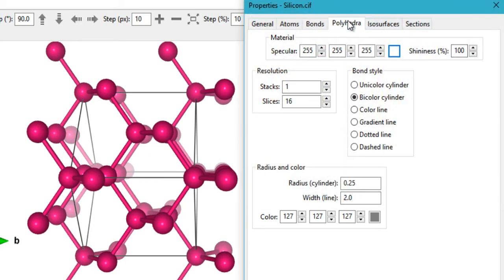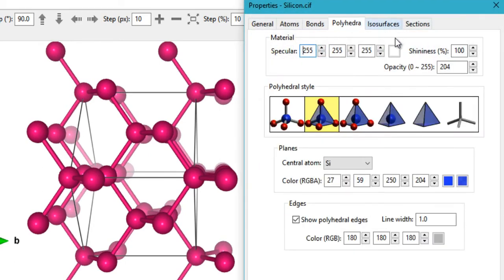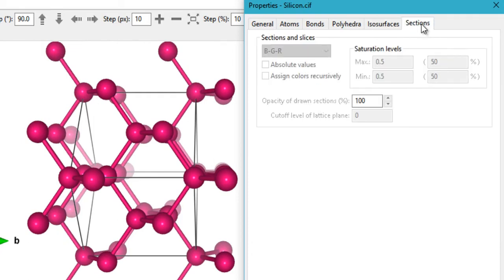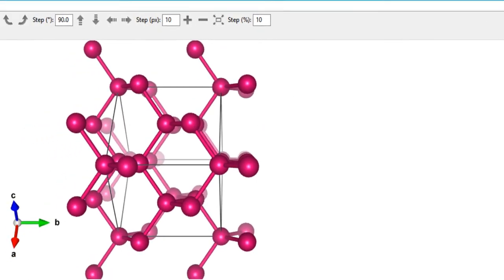You also have properties for polyhedra — styles and shininess for polyhedra shapes. Then there are properties for iso surfaces, which are useful if you're visualizing a lattice plane. There's also a Sections option, though I'm not certain what that does.